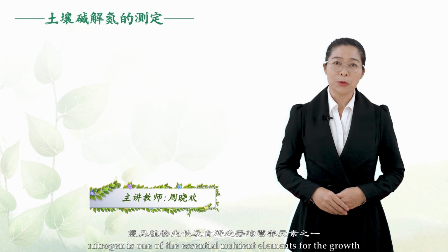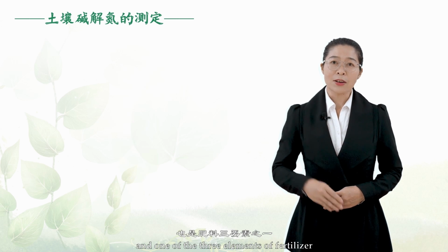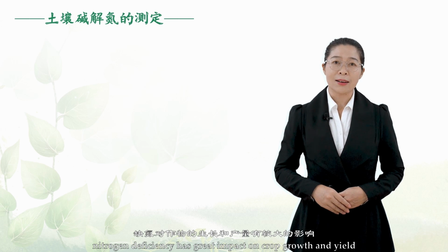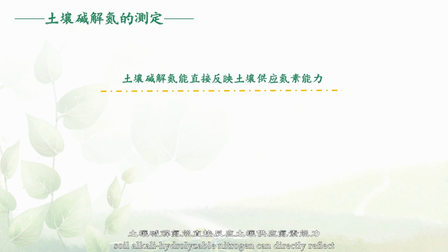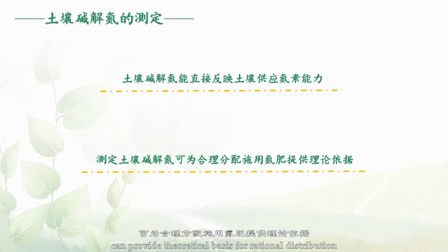Nitrogen is one of the essential nutrient elements for the growth and development of plants, and one of the three elements of fertilizer. Nitrogen deficiency has great impact on crop growth and yield. Soil alkali hydrolyzable nitrogen can directly reflect the ability of soil to supply nitrogen. Measuring soil alkali hydrolyzable nitrogen can provide theoretical basis for rational distribution and application of nitrogen fertilizer.